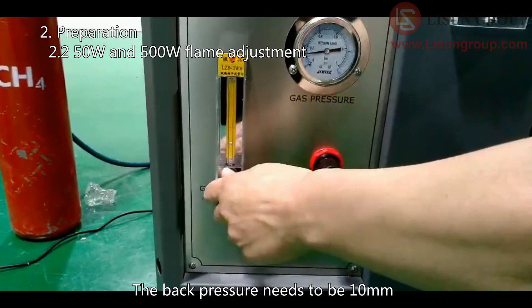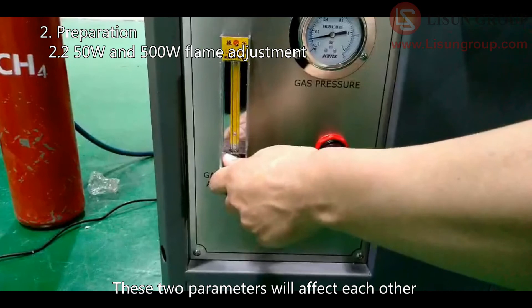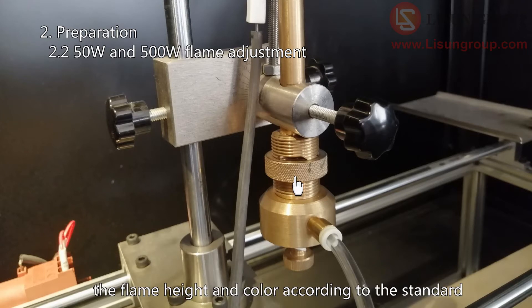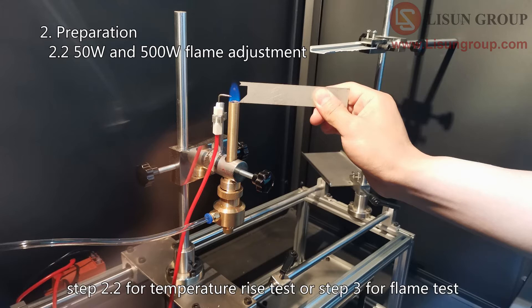The back pressure needs to be 10 millimeters. These two parameters will affect each other, and the two parameters need to be adjusted together. Adjust the knob of the Bunsen burner to adjust the flame height and color according to the standard. The 50 Watt flame is a 20 millimeter blue flame. After the adjustment, you can go to step 2.2 for the temperature rise test or step 3 for the flame test.